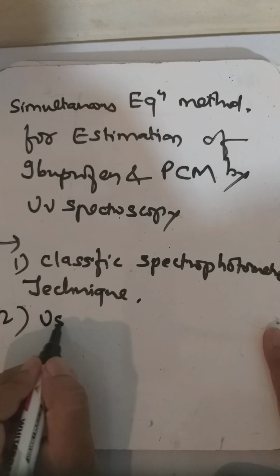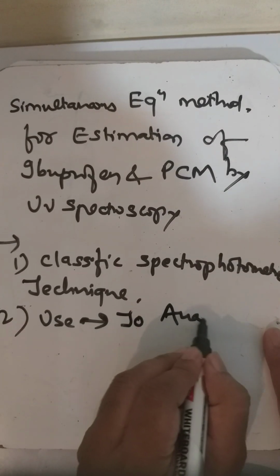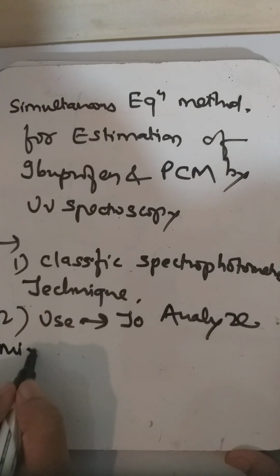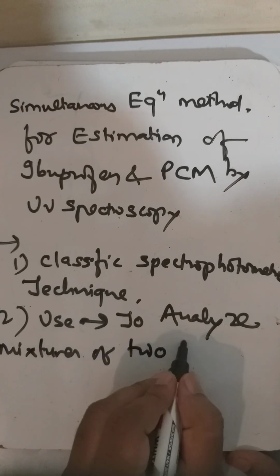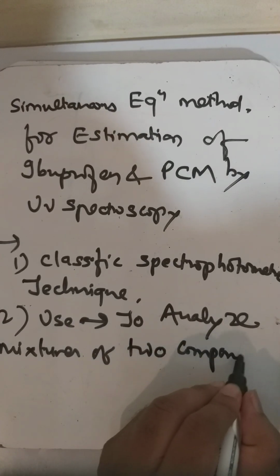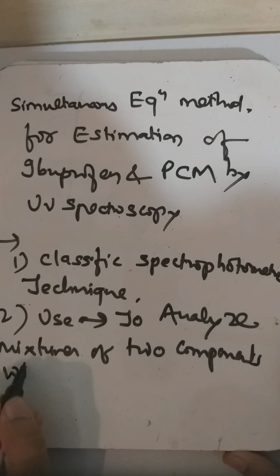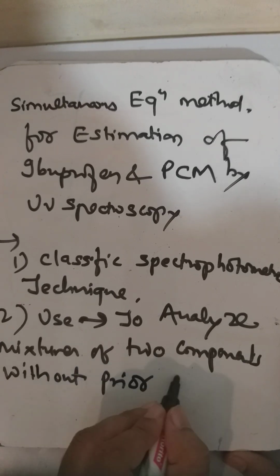Its use is to analyze mixtures of two components. Okay, are you getting what I am saying? Without prior separation.